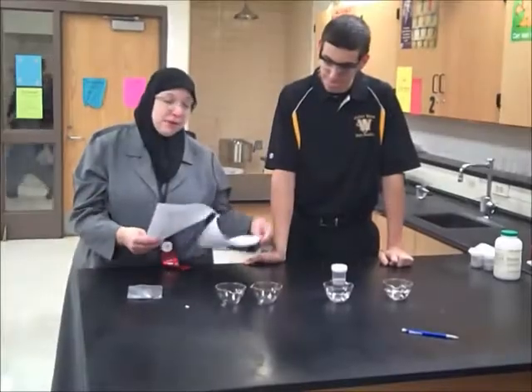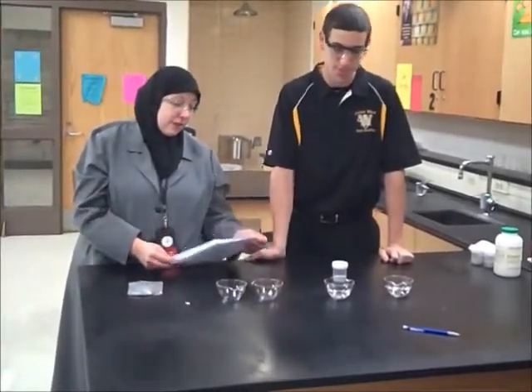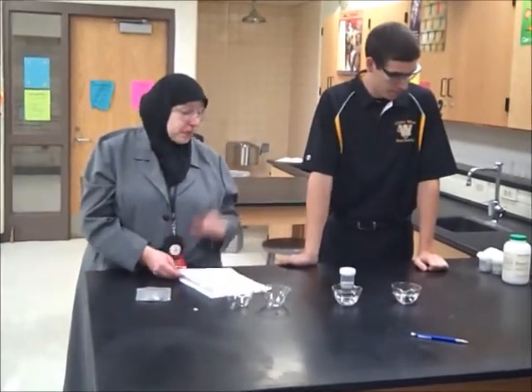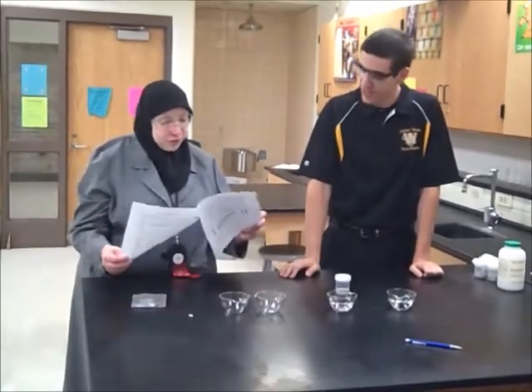Alright, so this is the periodic trends in reactivity. This is the lab that goes along with Goal 3 periodic table. This is Nick. Say hi, Nick. Hi. Hi, Nick. I'm Mrs. Otry, and Nick is going to demonstrate the lab.